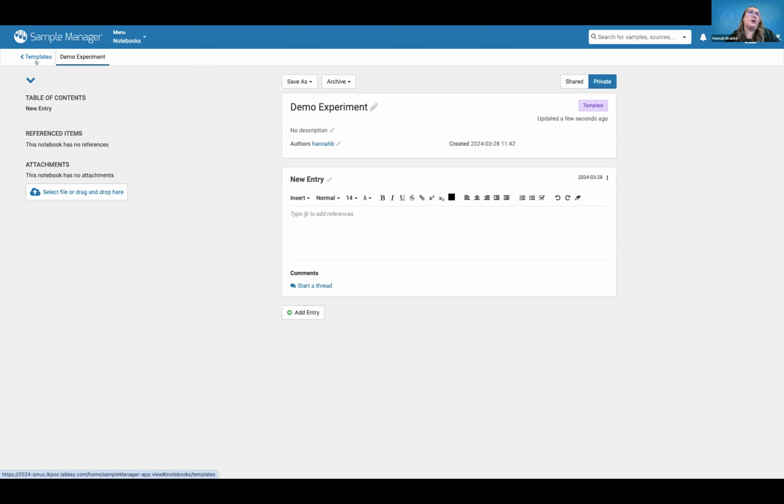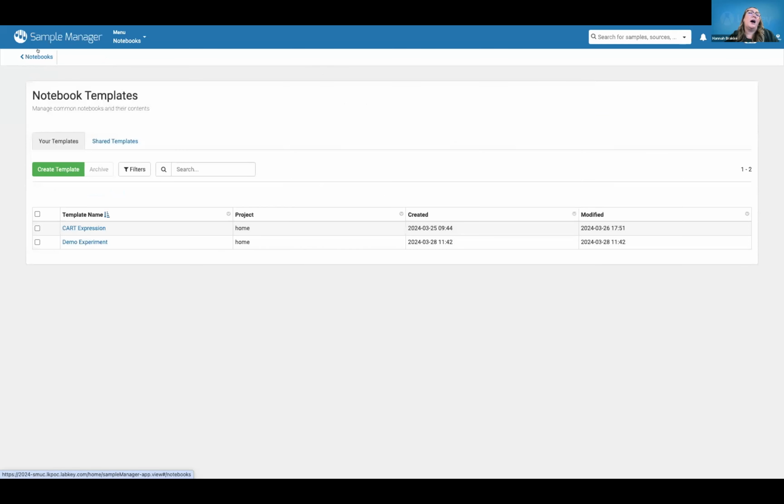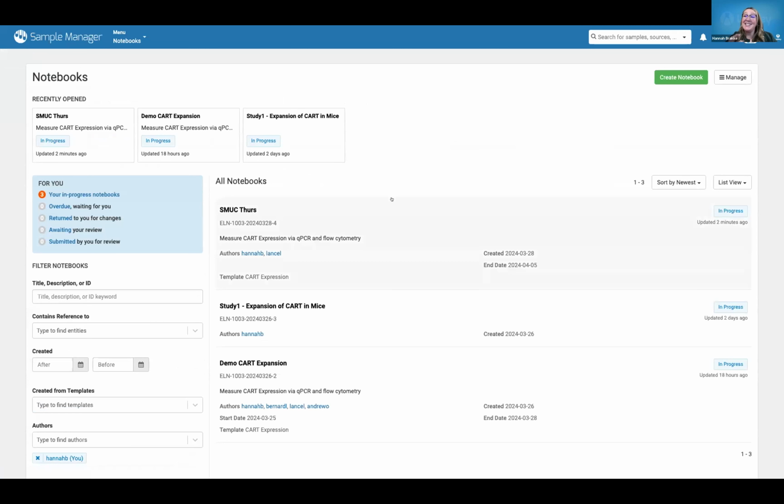And then of course, once you're starting the experiment, those can be altered and deviated from as needed and as captured. Take a quick look and take a quick minute.